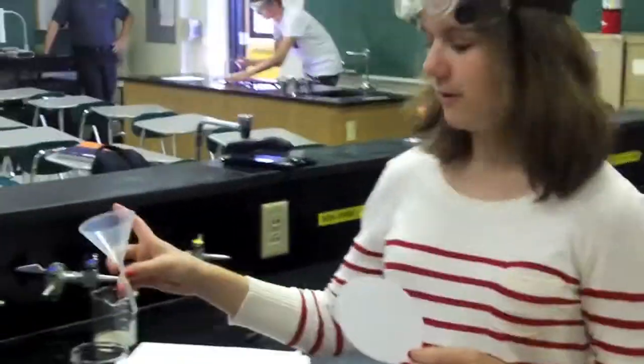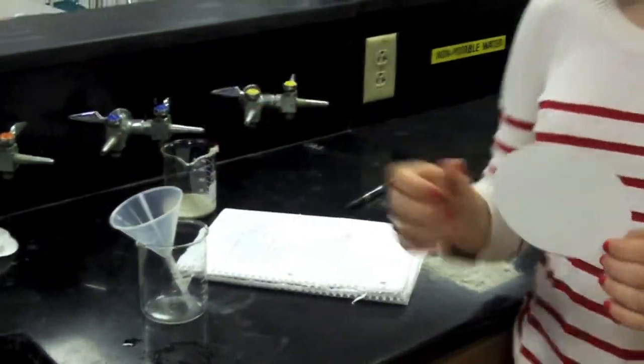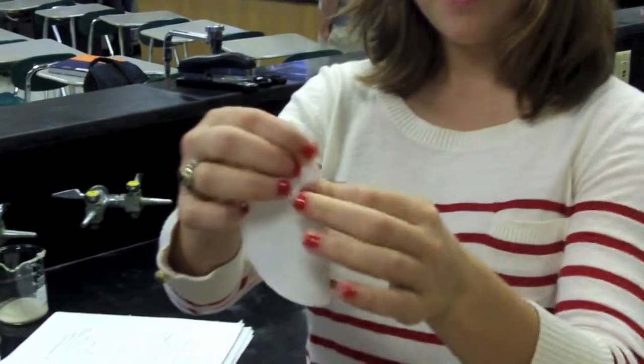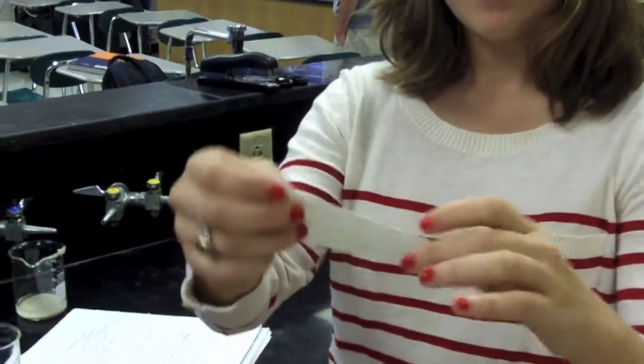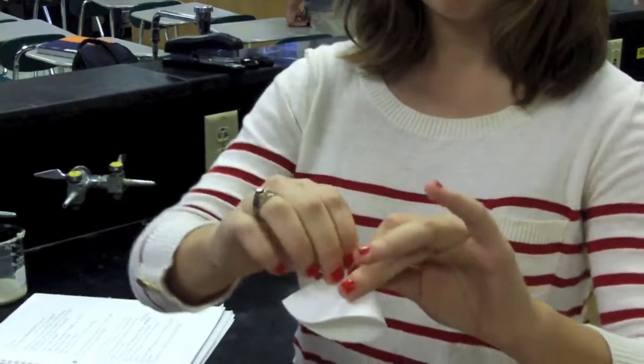The filter paper is a circle, so you need to fold it so that it fits into this funnel, which then fits into this beaker. Fold it in half once, making a half circle, making sure that you crease it, and then fold it in half one more time.